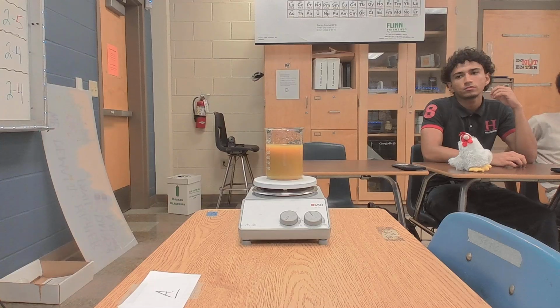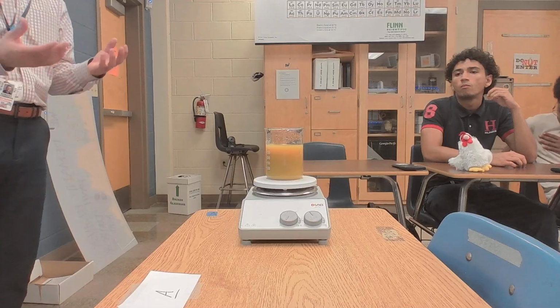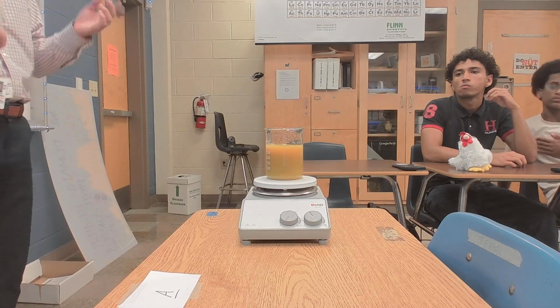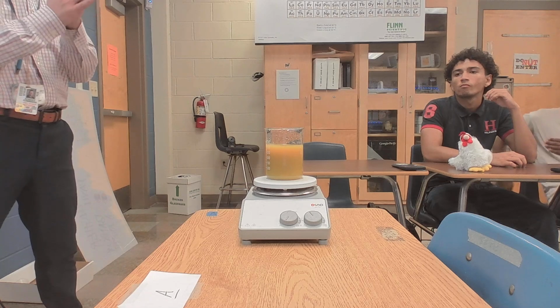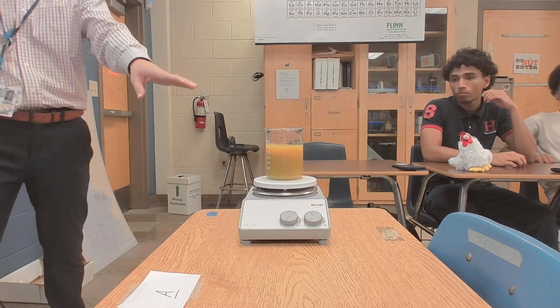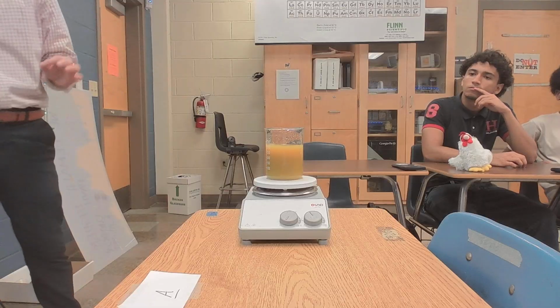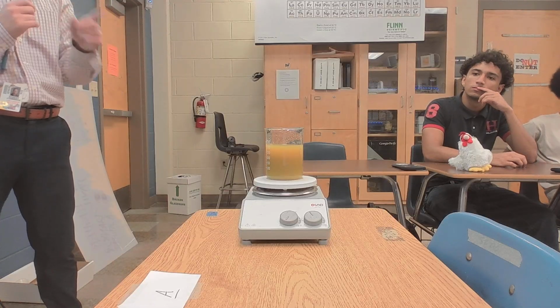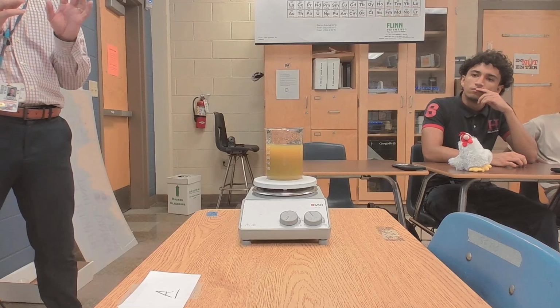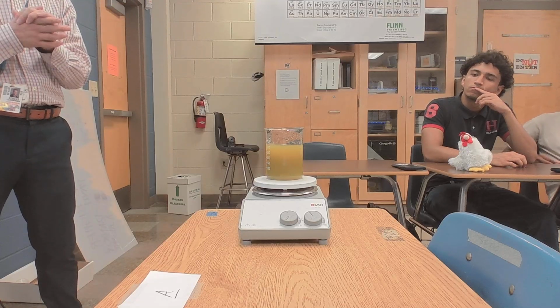You are really used to fast reactions. We're always time pressed in here. So usually you mix stuff together and a reaction takes place. But there are some reactions that take a very long time to go. This one's not very long, but it's certainly delayed. Because as you continue to stare at it, you're going to see that while you can still get hints of vomit, that green is about to become more of a Gatorade type green.